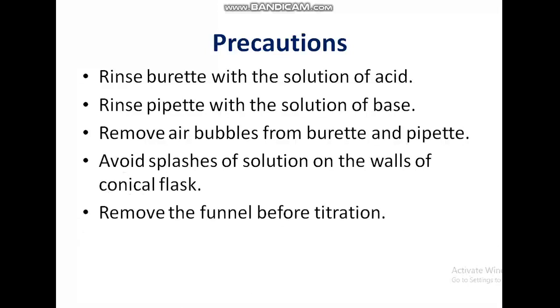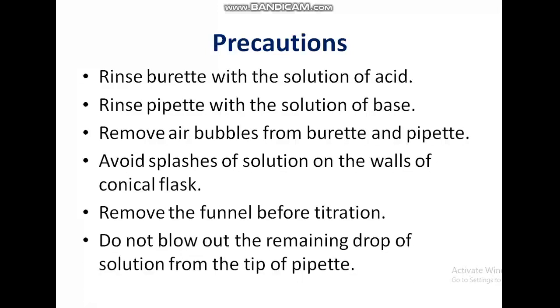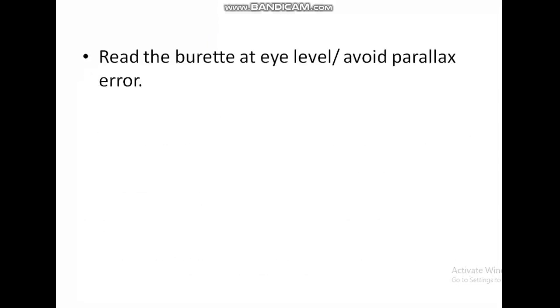Very, very important. Most students do not obey this particular precaution, removing the funnel before titration. Always remember to remove the funnel before titration. Do not blow out the remaining drop of solution from the tip of pipette. Read the burette at eye level or avoid parallax error.